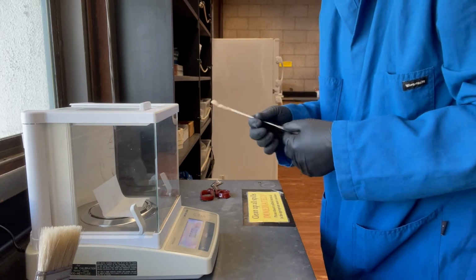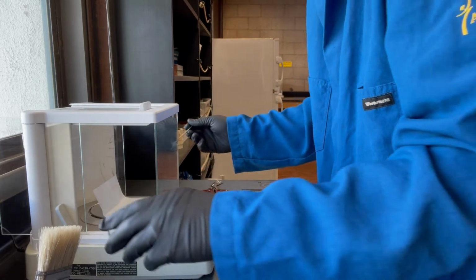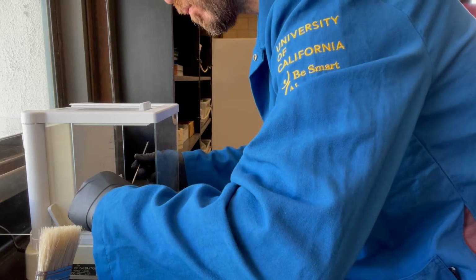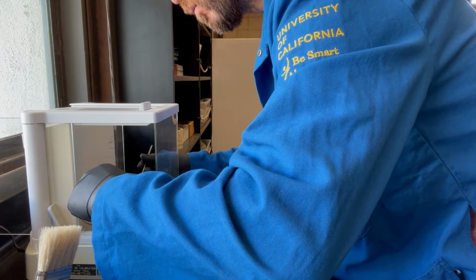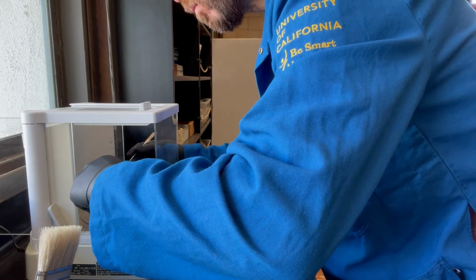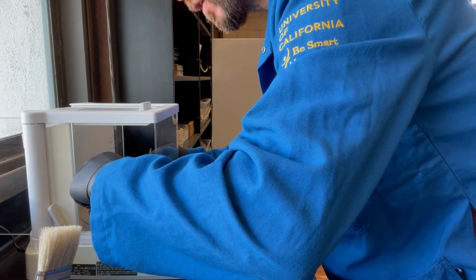So we need 5-ish grams. I'm just gonna go ahead and scrape some off. About 2 grams.